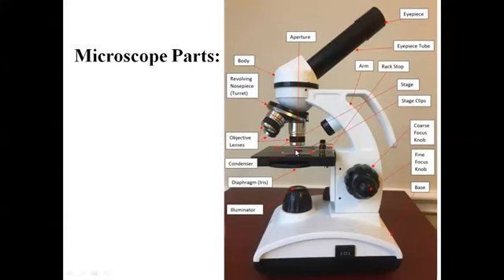As we can see, this hole we can give the name aperture, because the aperture is the place where your light is ultimately coming out and entering into the sample, right? So this is all about the different parts of your microscope and their function. The illuminator is the source of light. The diaphragm is limiting the amount of light that is illuminated by the halogen lamp. The condenser is condensing the light into one particular place, and that light is coming out of this small hole that is called your aperture. Fine. So this is clear about the parts of the microscope.